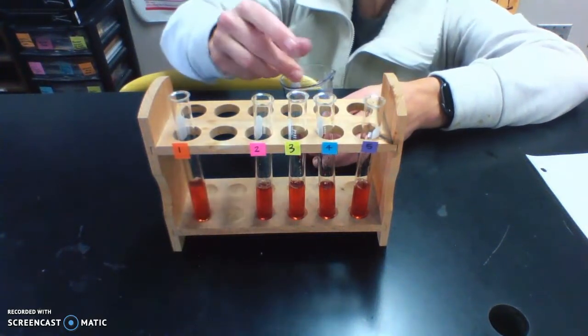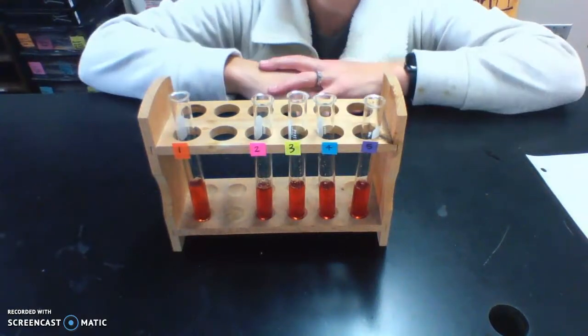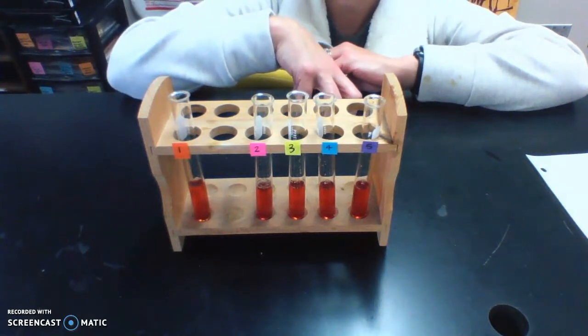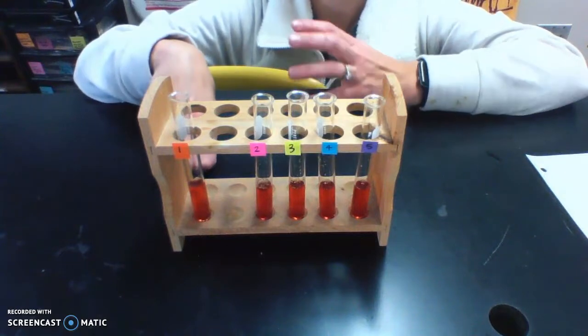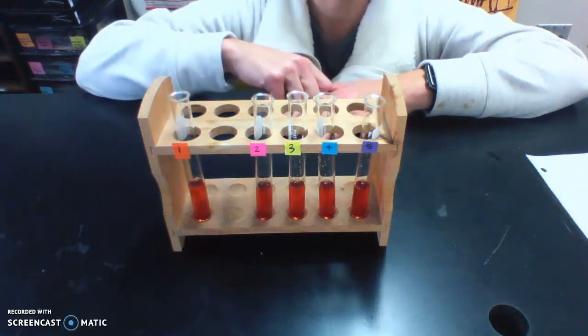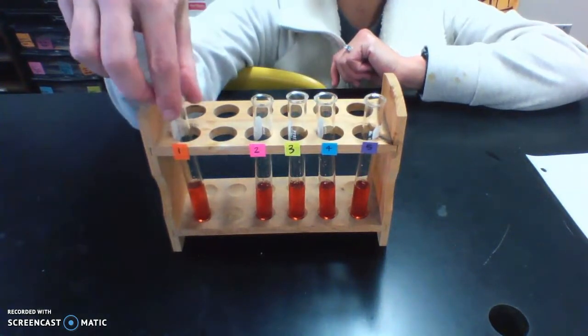All right, so based on color change, just like in the last one, we'll be able to see which way it shifts. Does it stay at the red side, that iron thiocyanate ion, or does it shift back to our original substances? So we don't necessarily know what color that is right now. We just know it's going to be a change from what we're looking at. All right, so we'll keep this one. Number 1 is the control.